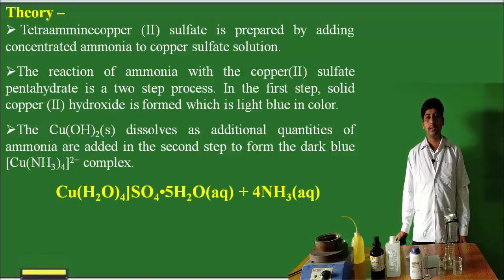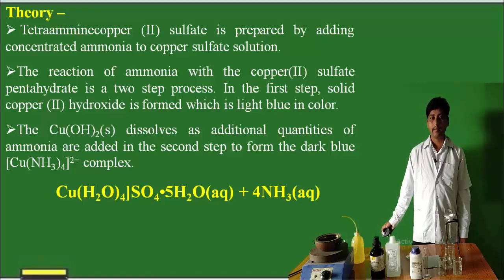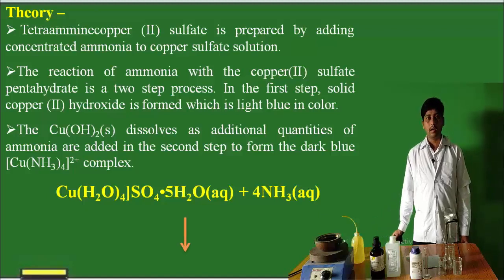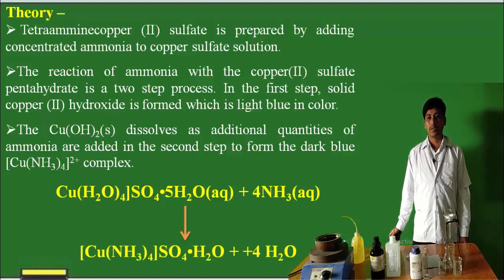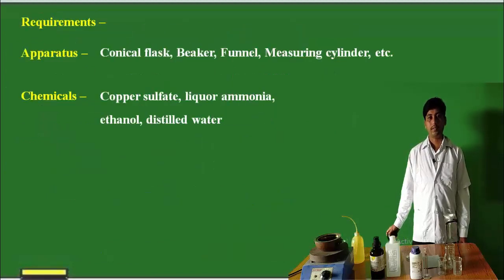Now, the reaction. You can observe here: there is copper sulphate in the hydrated form — penta-hydrated. When we add concentrated ammonia, the reaction proceeds and we will get the product, that is tetramine copper sulphate. This is the reaction.